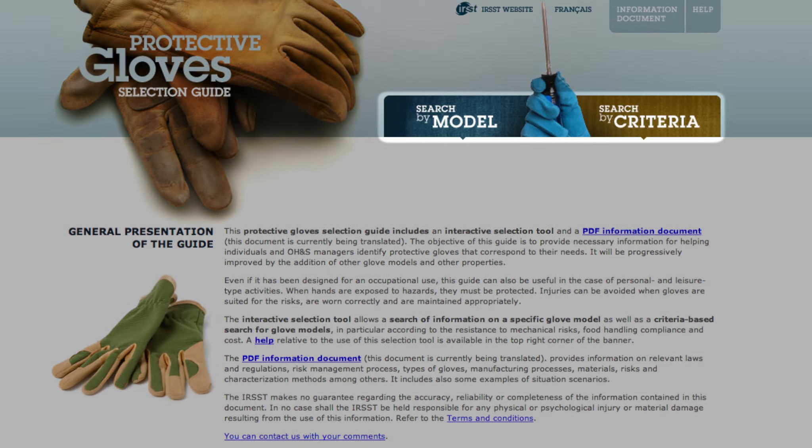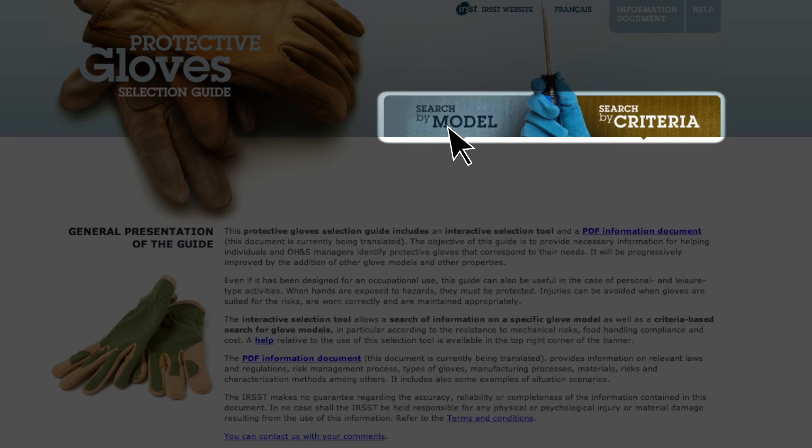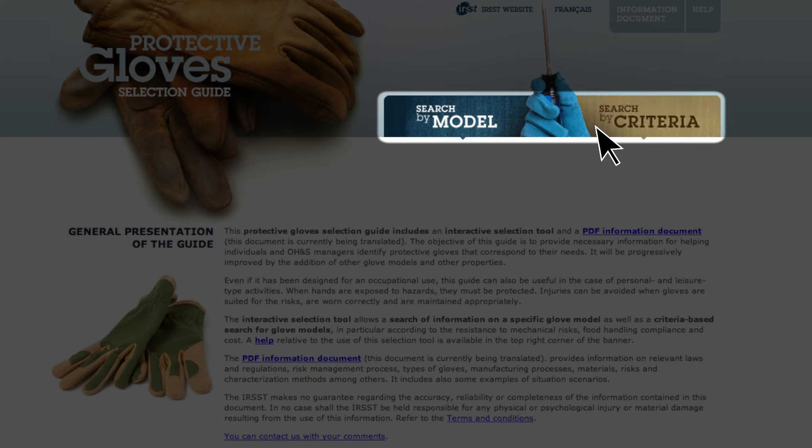From the homepage, there are two options: a search by model or a search by criterion.